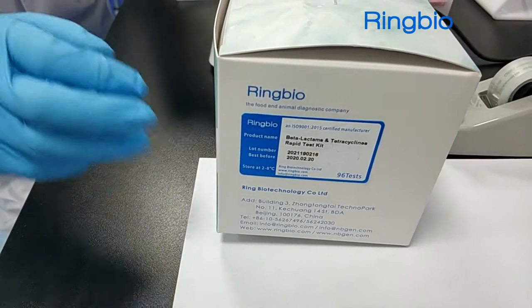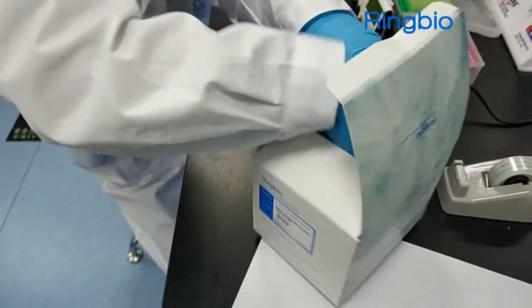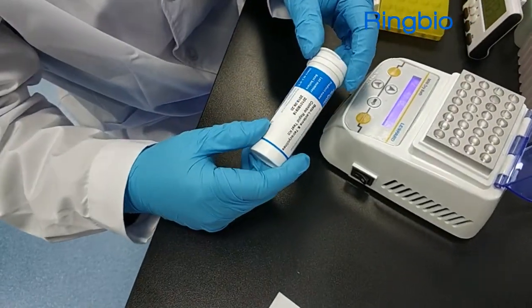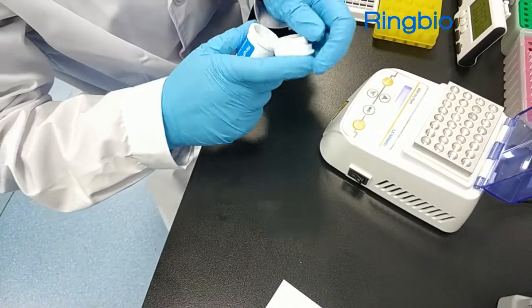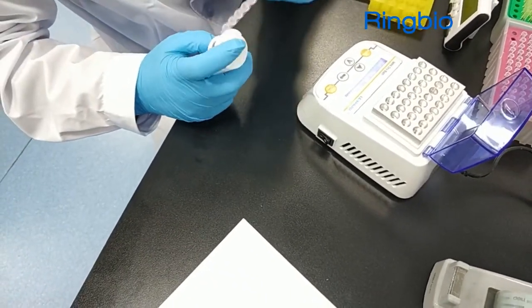Bring the kit to room temperature, take required tubes, and seal the rest. Check the production and expiry information to make sure the test kit is valid. Open the tube cap and take out the strips and microwell reagent required. Seal the rest for future use.